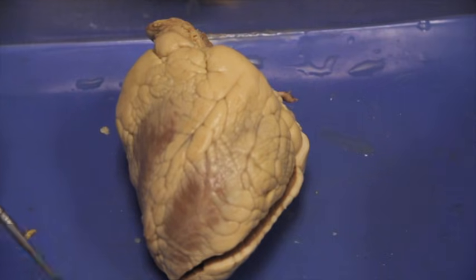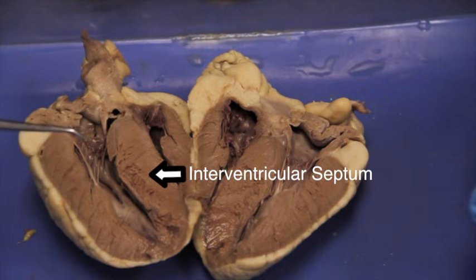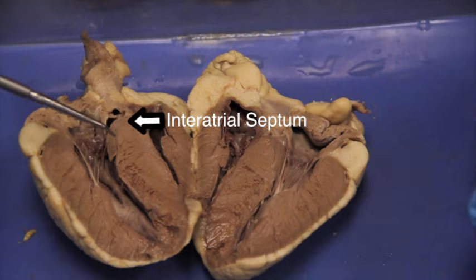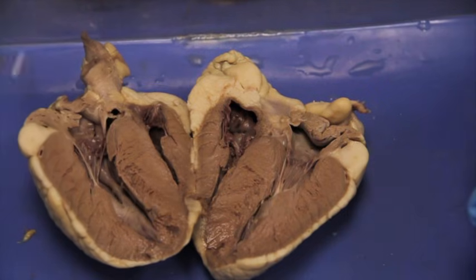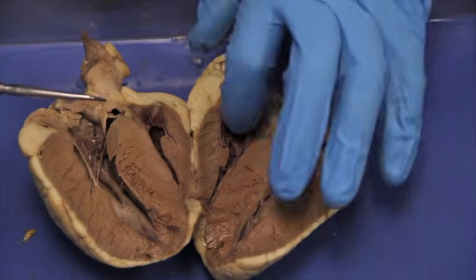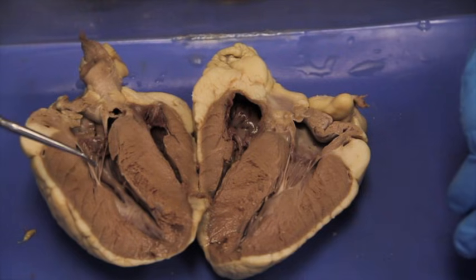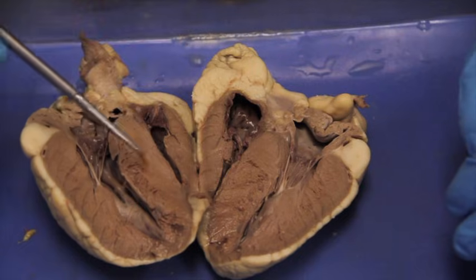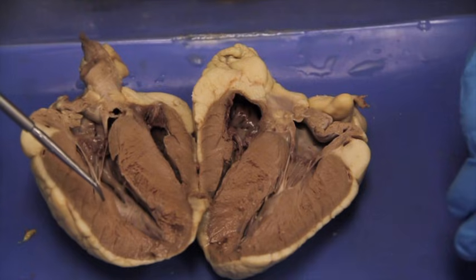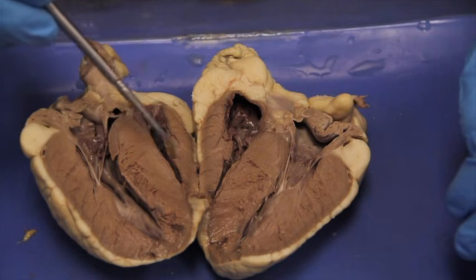Looking at our frontal section denoted by the anterior side, your group needs to locate the interventricular septum and the interatrial septum, the epicardium, the myocardium, and the endocardium. You can see that this myocardium is much thicker on one side — that must be the left ventricle, because the left ventricle needs more force from muscle contraction to eject blood into the aorta into the body circuit, which is much longer than the pulmonary circuit, which is done by the right ventricle.